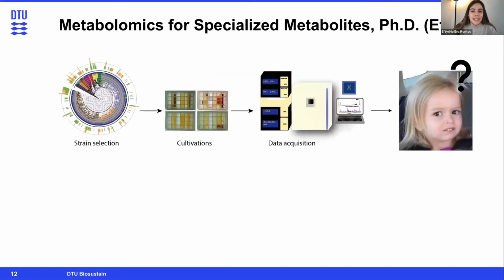Okay, so thanks a lot, Axel, for the nice introduction. And hi, everyone. My name is Effie, and as you heard already, I'm not affiliated with OpenMS at all. So how did I end up presenting today? I have this PhD project that's called Metabolomics for Specialized Metabolites. And I aim to develop a more high throughput workflow for screening the thousands of actinomycete strains that we have in our collection in order to discover new natural products in general.